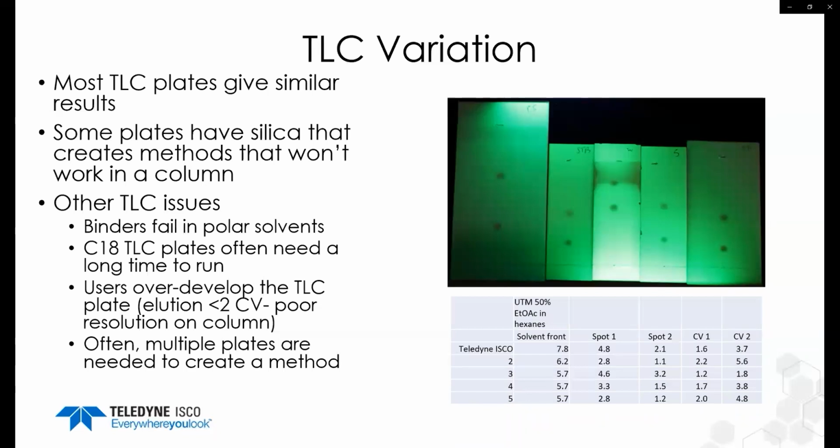Other issues with TLC plates include the binder that keeps the silica attached to the plate dissolving in very polar solvents, and reverse phase plates often need a long time to run, especially in polar solvent systems. It is common that several trials are needed to make a good method to convert to chromatography, so several TLC plates need to be run, which takes time.